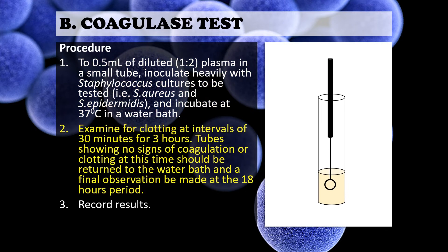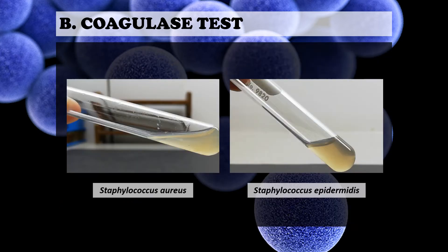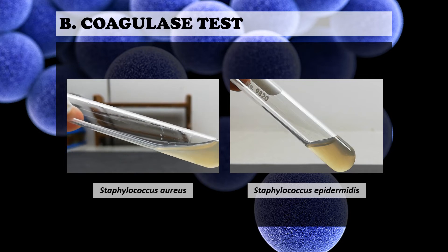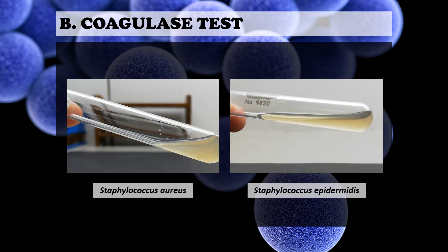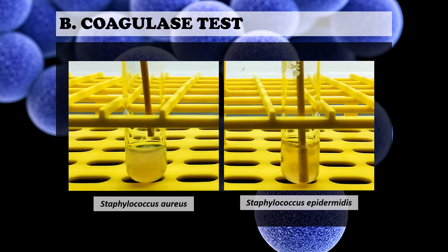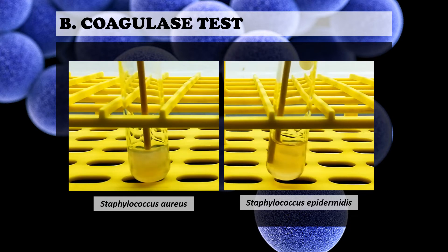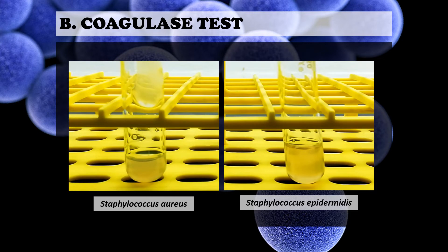After 30 minutes, examine for clotting at intervals of 30 minutes for 3 hours. Tubes showing no signs of coagulation at this time should be returned to the water bath and the final observation made at the 18-hour period. Then record your results. In the Staphylococcus aureus tube, you can see a slightly cloudy gel-like clot formation in the upper portion, while there is none in the tube for Staphylococcus epidermidis. In another video clip, you can see the gel-like clot in the tube of Staphylococcus aureus, indicating that this organism is coagulase positive.